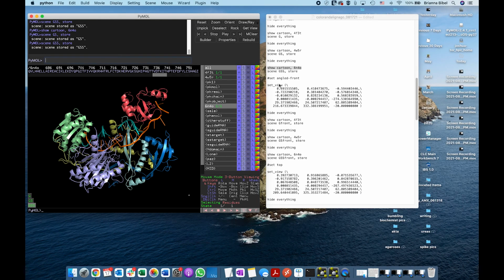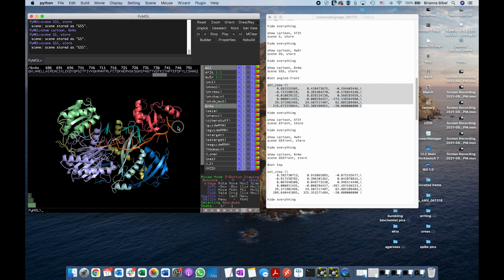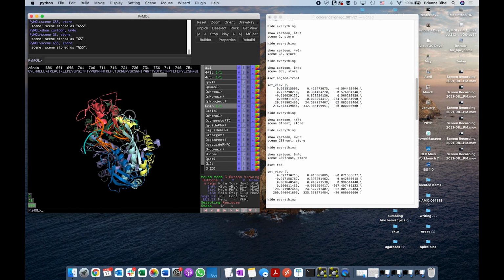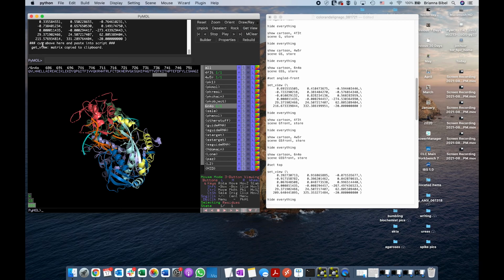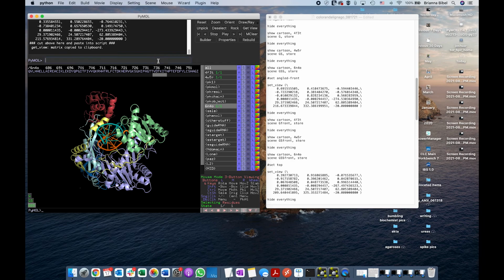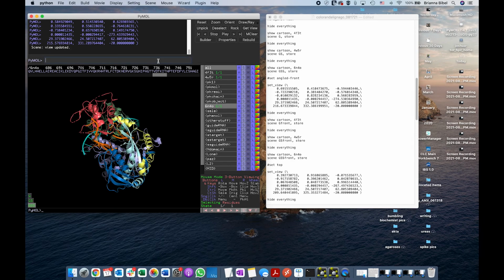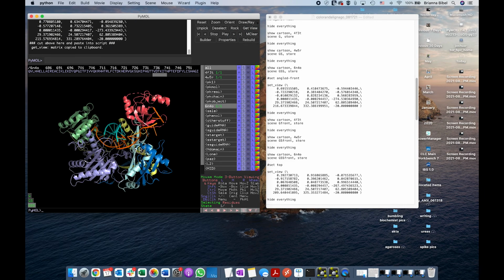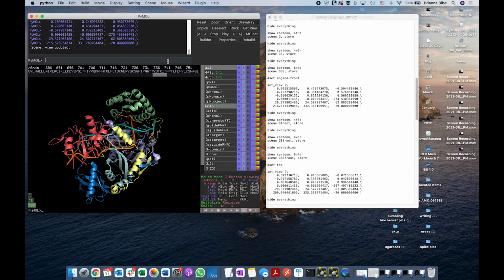and so now I want to change the view. I had saved the view, so I could just come and try to find the view, but I already set the view I like. And if you're on a view, you can do get view, and it'll copy this into your paste. And then if you were to do this, now you can go back to where you were before. Get view. There we go. Yes, it is going back. I just looked away too quickly. Okay, but right now I want to set it in that angled front.